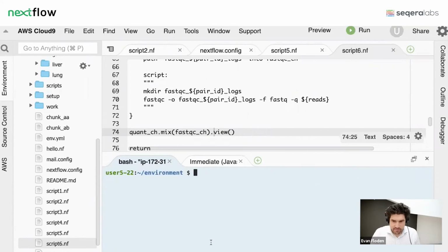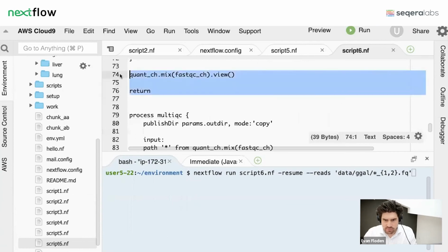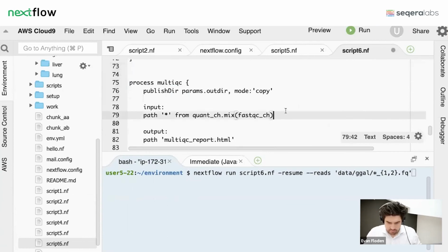Hopefully that is somewhat clear. This is the key part to understanding how data flow is working here. The nice thing about this is that if you ran 10 samples, or if you ran 1,000 samples, you would get exactly the same behavior. So let's run through the final step here and see this completely. I believe I've fixed everything. I should just remove my return statements here and put my collect on there.